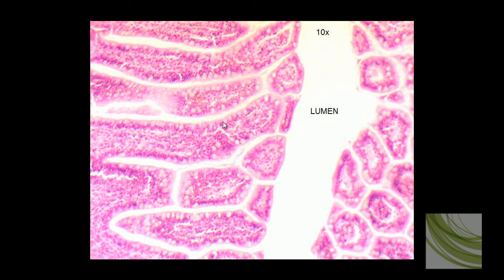We can see these large blank cells. Those are goblet cells. Goblet cells, and we'll see them better at 40X, secrete mucus.